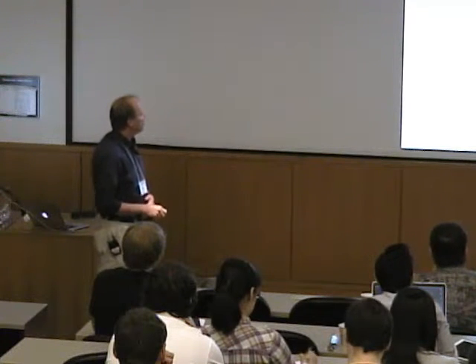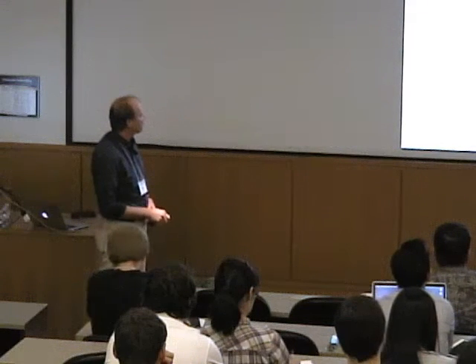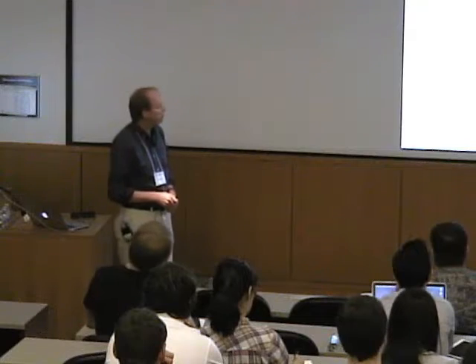So in NMR, typical spectral width is somewhere between 1 hertz would be a really narrow NMR spectrum, and 100 kilohertz is a very broad solid-state spectrum. And if you compare that in EPR, the widths are, from a megahertz is a really narrow one, and EPR spectra can be as broad as several gigahertz. Right? So we're thousands of times wider than an NMR spectrum, and this also has really important consequences for how we do the experiment.